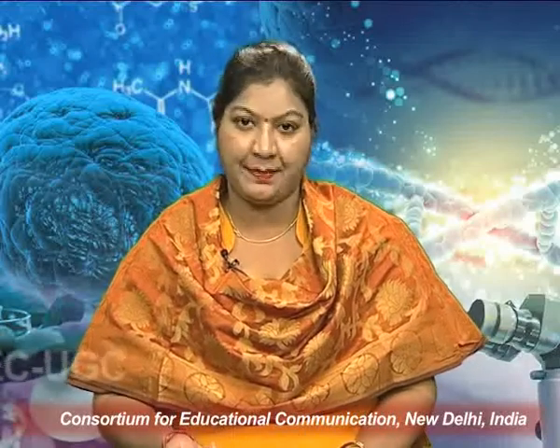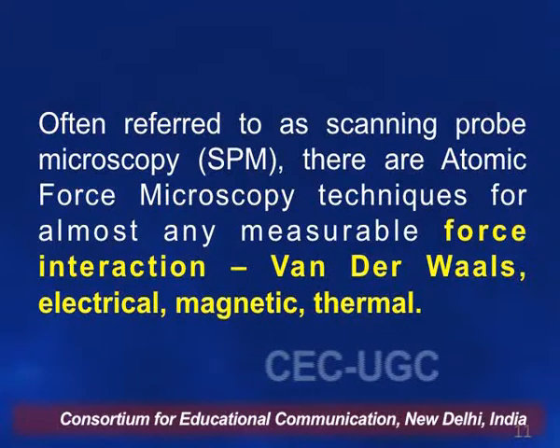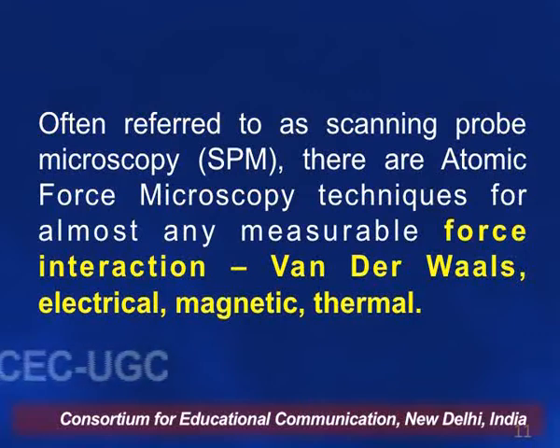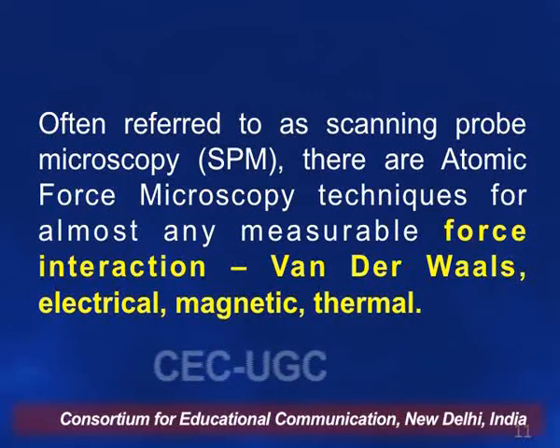Often referred to as scanning probe microscopy, SPM, there are atomic force microscopic techniques for almost any measurable force interaction.